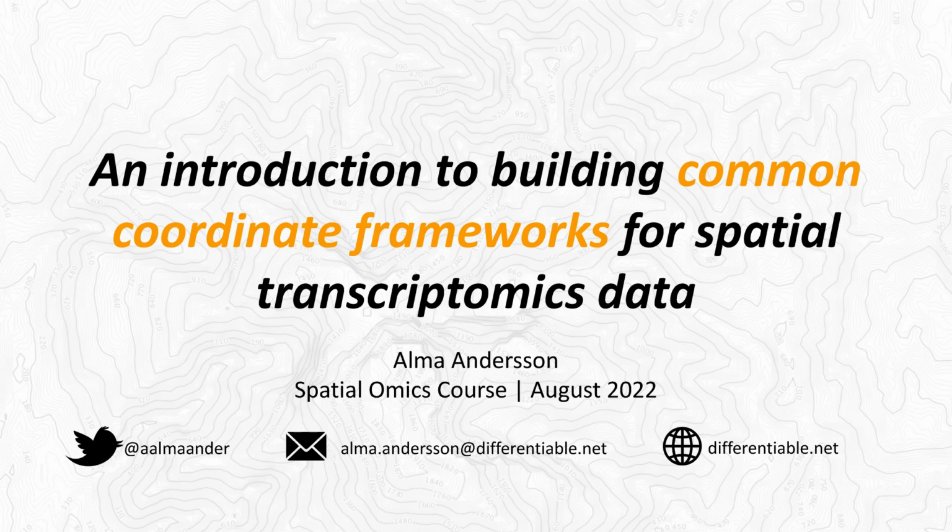Hi, this is Alma, and I'm here to give you an introduction to building common coordinate frameworks for spatial transcriptomics data. Now, this idea of a common coordinate framework is a fairly new one, and that means that this field of common coordinate frameworks for spatial transcriptomics data is not quite as established as other topics in the analysis of spatial transcriptomics data.